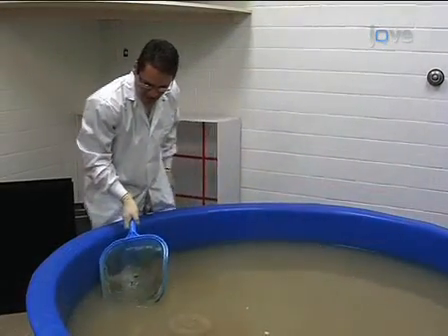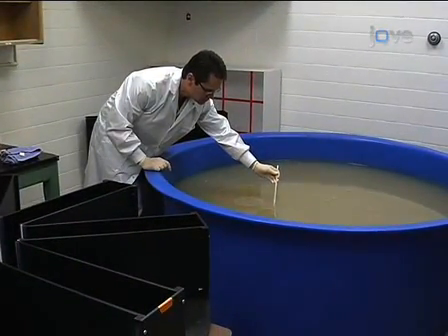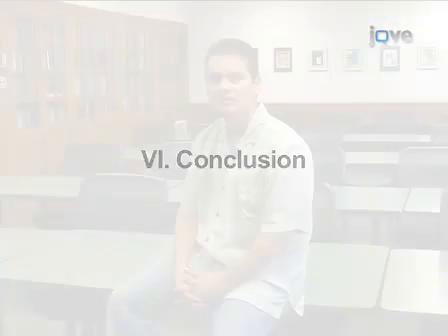Correctly clean out the pool, make sure the platform is in its place, and check that the water temperature is the same. You can use the smart video tracking software system to detect and analyze behavior during the testing trials. I've shown you how to train the animals and test the animals. This is a very well-established behavioral paradigm. Good luck with the experiments.